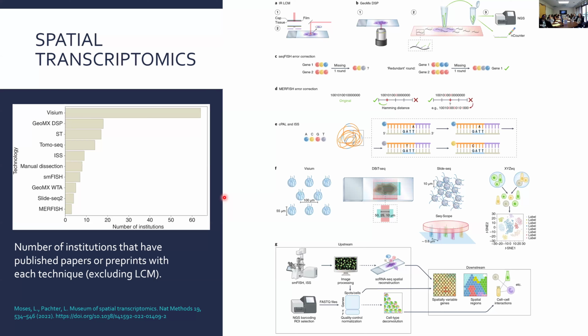Okay, so then how is spatial transcriptome different? This is a figure I found showing the number of institutions that have the different technologies available. And again, Visium is crushing the field, as far as 10x is the one that most institutions have as their primary means of performing this technique. You don't need to look at all the details over here, really. I'll show 10x's approach in a second.